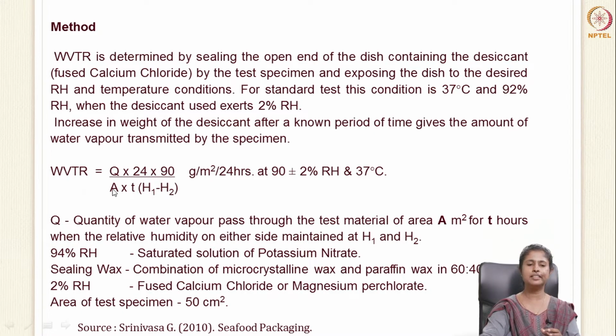And it is calculated as Q, which is the quantity of water vapor that has been transmitted in whatever area you have taken for your packaging material, for the time T hours, 24 hours if possible, when the relative humidity on either side is maintained as H1 and H2.